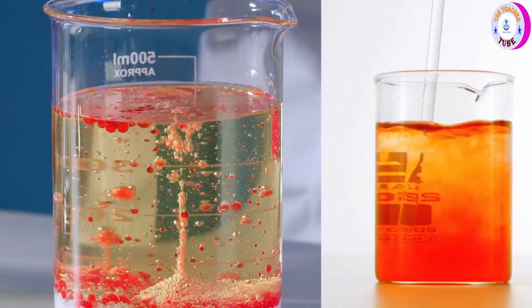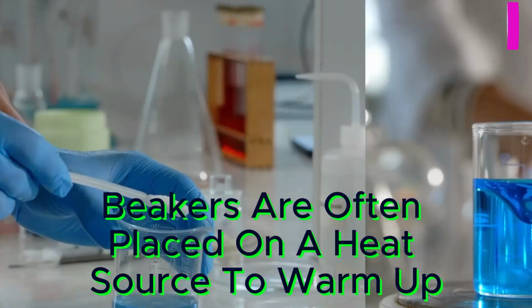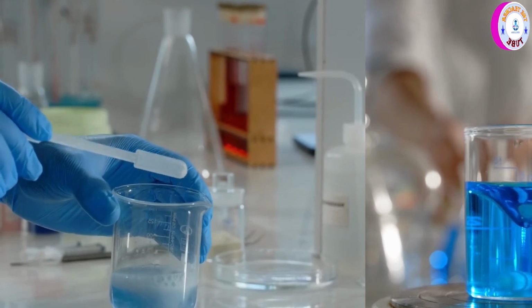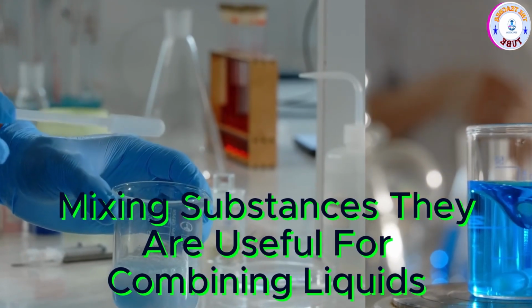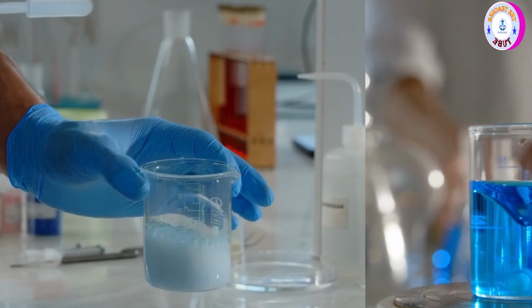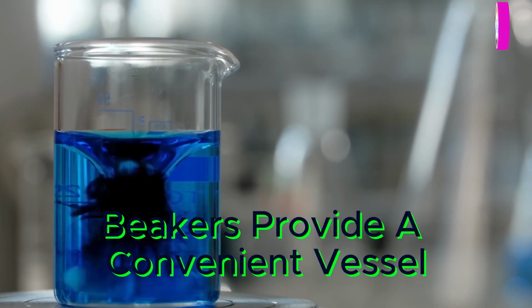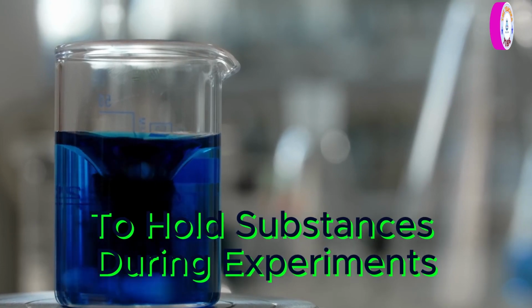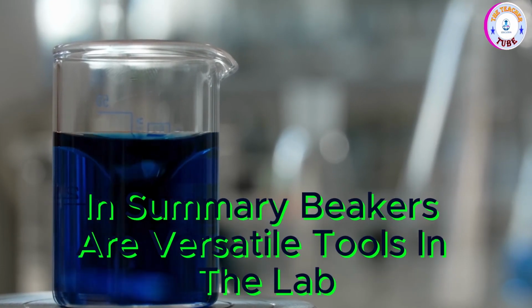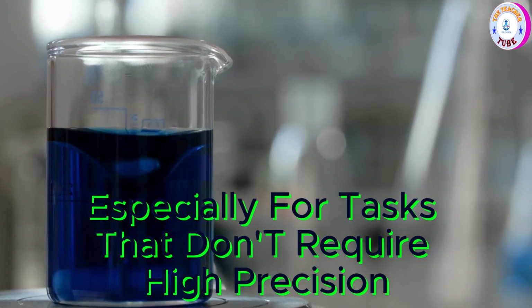2. Heating substances. Beakers are often placed on a heat source to warm up or boil liquids. 3. Mixing substances. They are useful for combining liquids or solutions in a controlled manner. 4. Holding liquids or solids. Beakers provide a convenient vessel to hold substances during experiments. In summary, beakers are versatile tools in the lab, especially for tasks that don't require high precision.